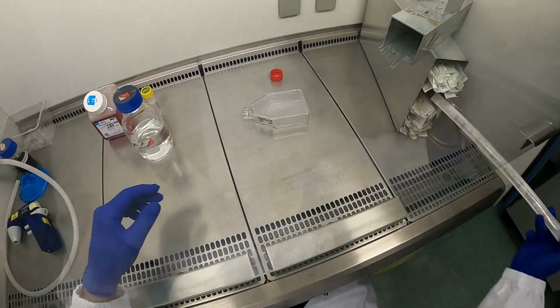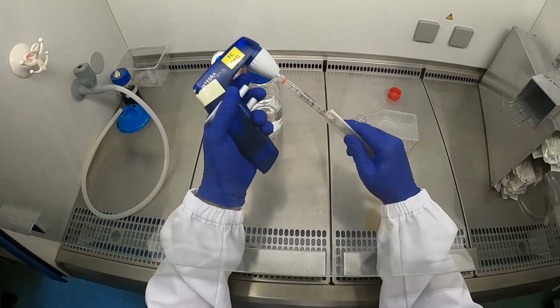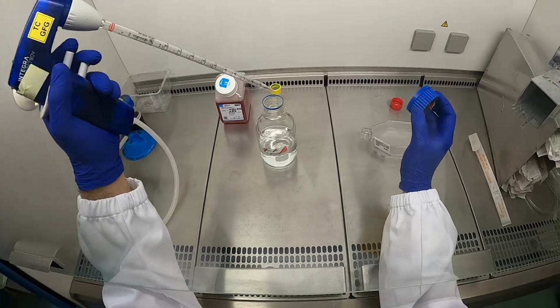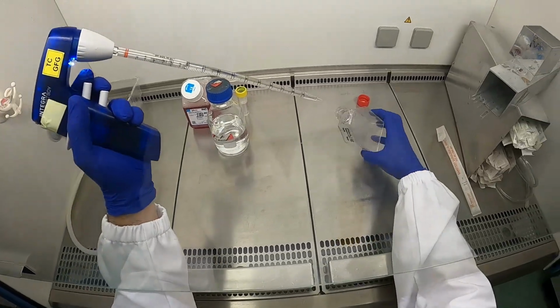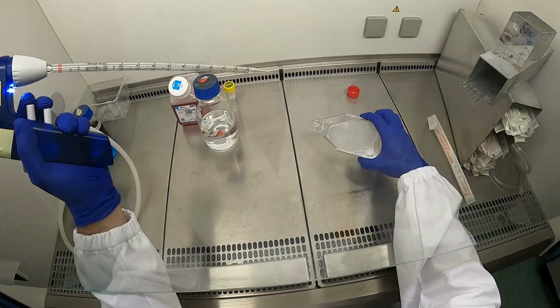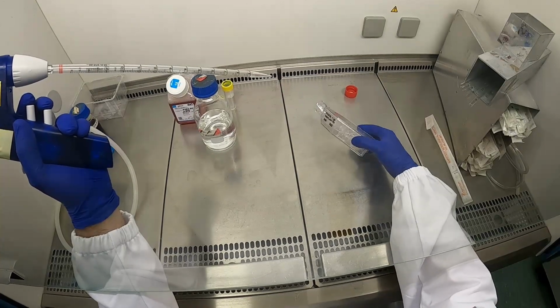Okay, take a 10 ml pipette, like that. Carefully take it out of the package. It's sterile, we have to keep it sterile. We take roughly 10 ml PBS. Doesn't matter how much you take, it's just enough to cover the surface of the flask and the cells, and by moving the PBS over the cells you wash away the medium.